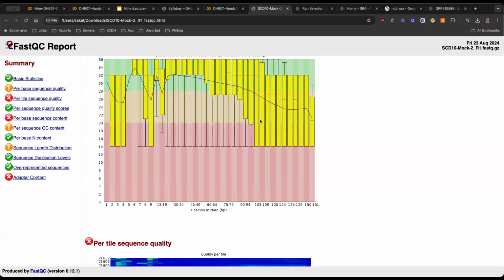So there's a fluorophore, and that was the blocking group, right? Without drawing everything, I'm just taking a brief detour. There is a blocking group here in your chain, which was the fluorophore. If there is a fluorophore attached here, it cannot be further extended. So what happens is you get rid of this fluorophore. You have to wait till that happens. Then you come and attach an OH group so that this can now continue. At this step, the polymerase is waiting, your camera is waiting, everything is waiting.